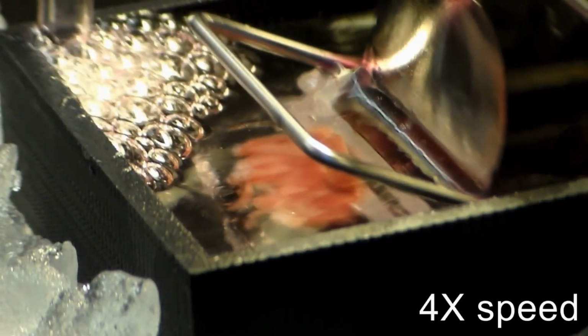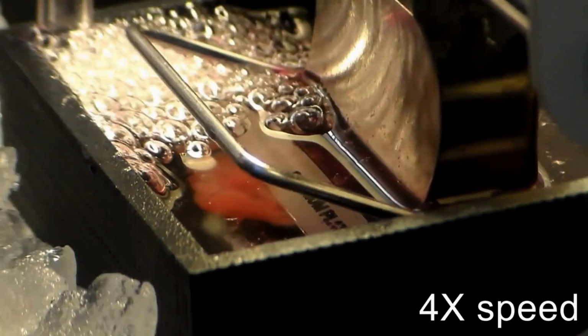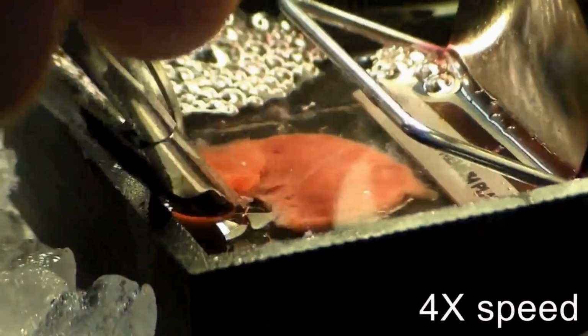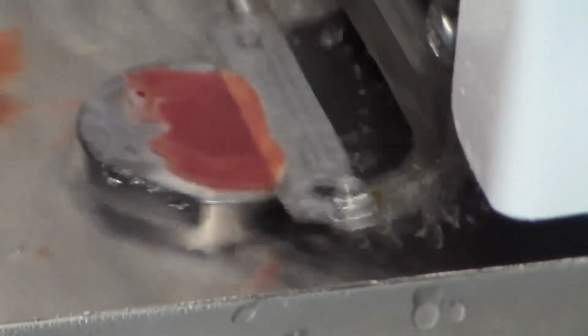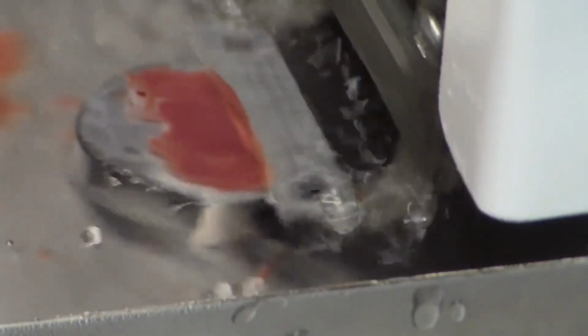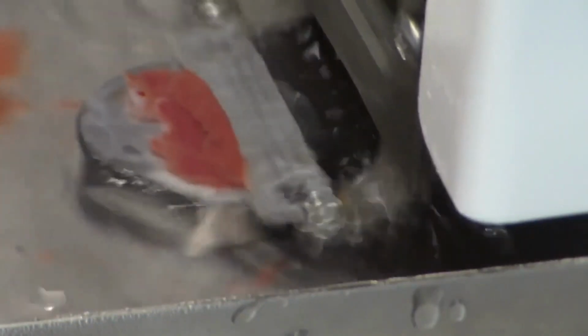And now I've sped up the slicing, but you can see that the vibratome is vibrating the razor blade back and forth and then moving the razor blade across the myocardium. The blade amplitude is about 1 or 2 millimeters, and the frequency is about 80 to 200 hertz. This is a more modern vibratome that's being used here for creating cardiac slices. But it's the same general idea.